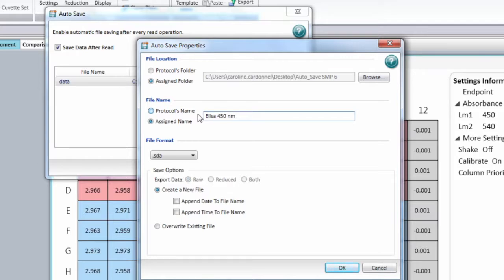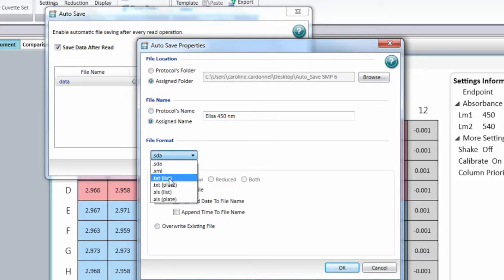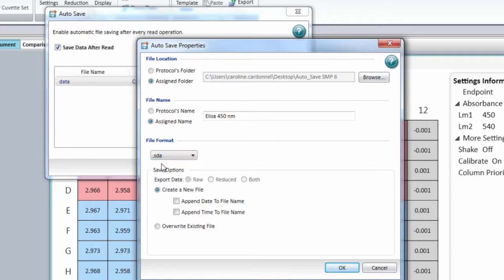For the file format, you're going to have SDA file, XML file, text file, and Excel file. The one we recommend is the SDA file, as it will allow you to open the data in SoftMax Pro with no manipulation of the data.